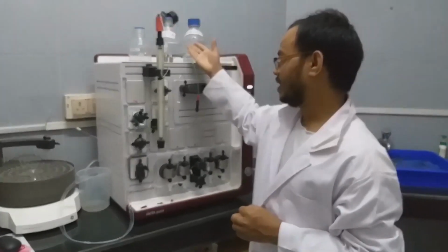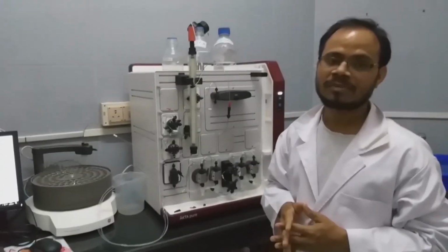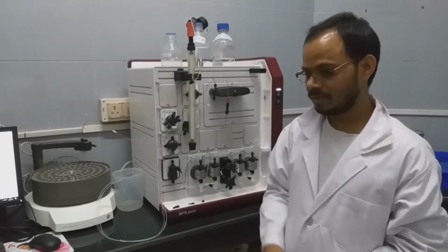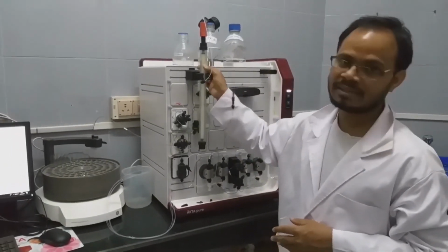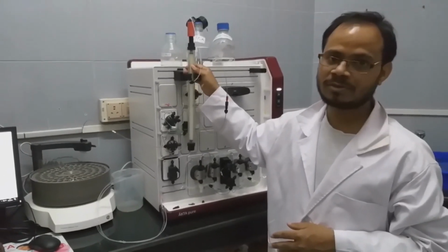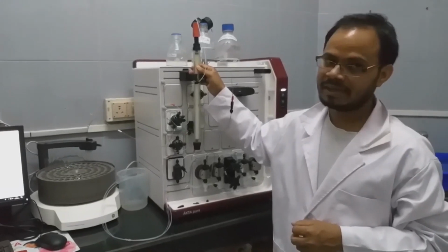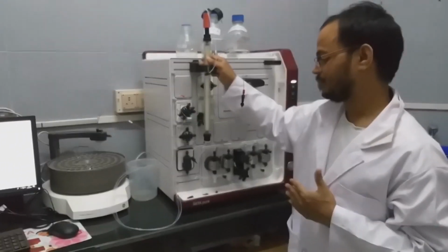Otherwise, if a chilled buffer directly enters the column, it may clog or precipitate some of the salts present in the buffer inside the column. That will also reduce the efficiency. So this also needs to be taken care of while running the FPLC.